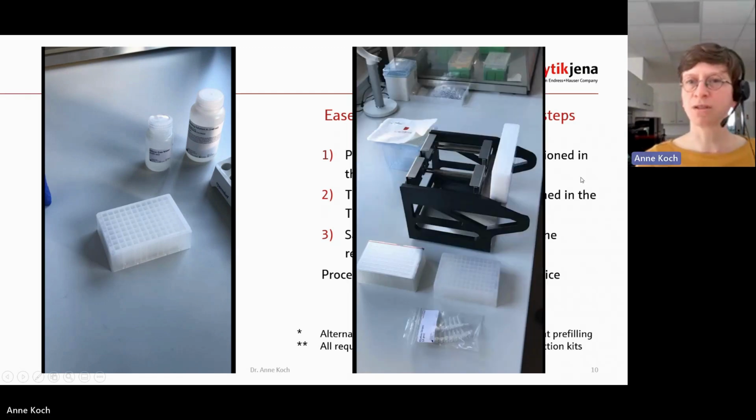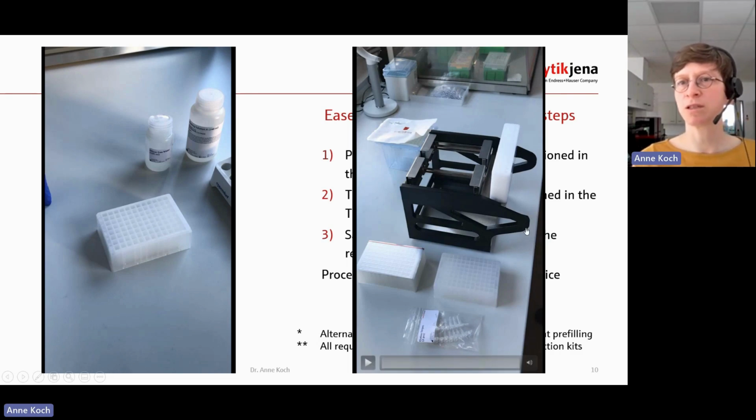Now, this is showing you how the sample tray is loaded. So the sample tray here is in the so-called priming station, which makes it easier. Like if you don't have so much space in the lab where your InnoPure is, you can also prepare the plate somewhere else and just conveniently carry up to 2 trays at a time with the priming station. And also it holds it at a nice working height as well.